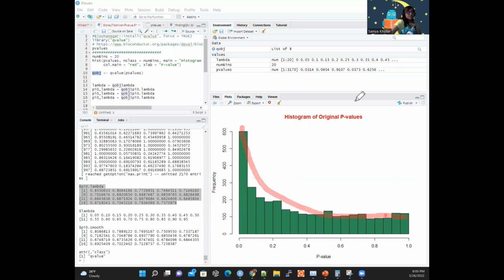Like we could even say, okay, let us suppose that it's starting to maybe flatten at 0.58, for instance. Then what we're really trying to see is, for a given lambda that we're estimating, what is the estimated proportion of null p-values that we get.